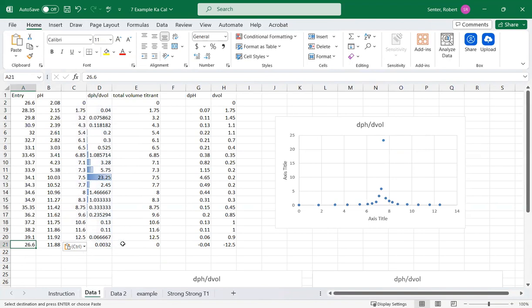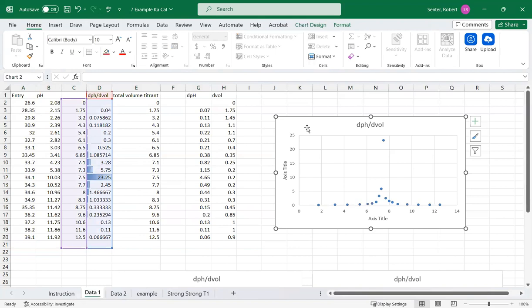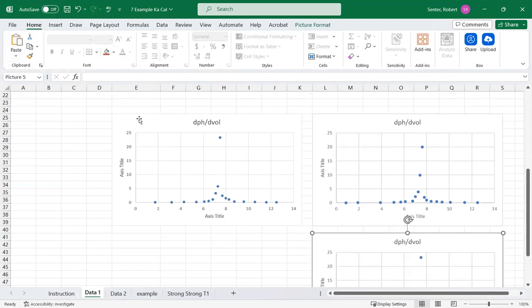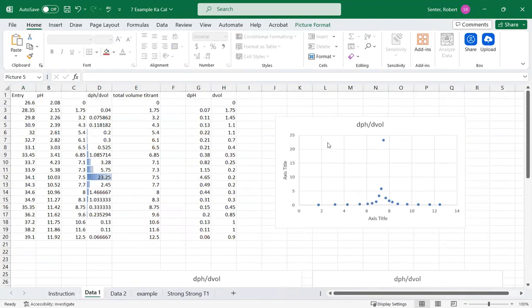All right. So you want to make sure you delete off the rows and not have those kinds of defects. You want to pay attention. All right. So now that we have this, then we can copy this and we'll paste it and have our picture. Then we'll have like trial 1, trial 2, so on. All right. So super simple kind of stuff. That's the easy thing for it.